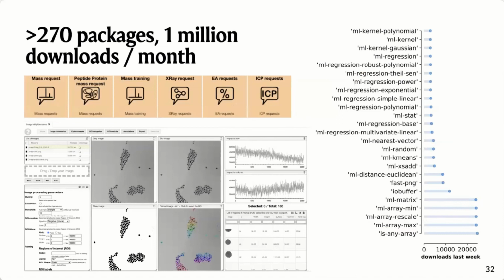The things he started developing are now used widely beyond chemistry. This shows that if you develop your ELN based on really small, reusable modules, they can be used beyond your own small domain, which might be chemistry, and they also allow you to be a bit flexible in developing new tools.